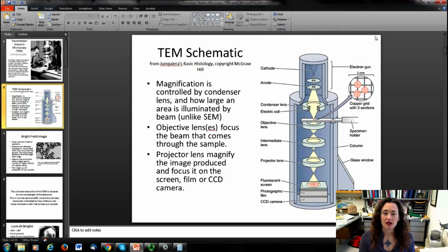All right, so this is similar in electron microscopes. You have an electron gun here at the top. The simplest form of the electron gun would be a tungsten filament, where you have a wire, basically a tungsten wire that's bent into a sharp tip, and then you pass a current through that wire, and the wire heats up, and then the electrons are kicked off due to their thermal energy. This is called thermionic emission, okay? So that's the most common.